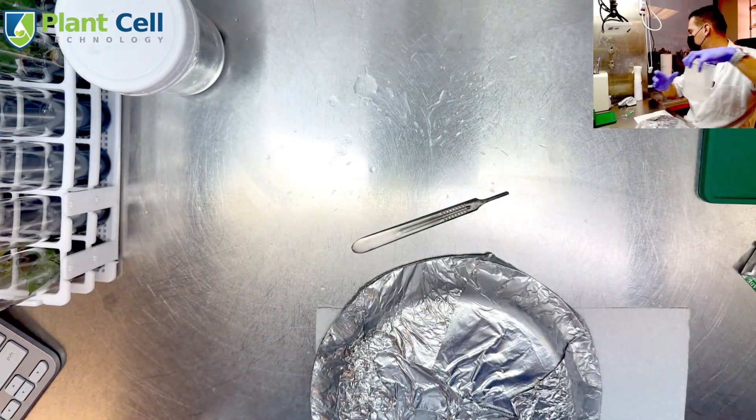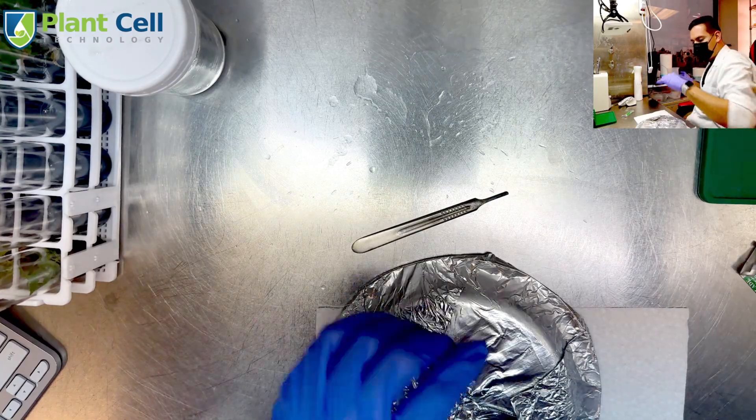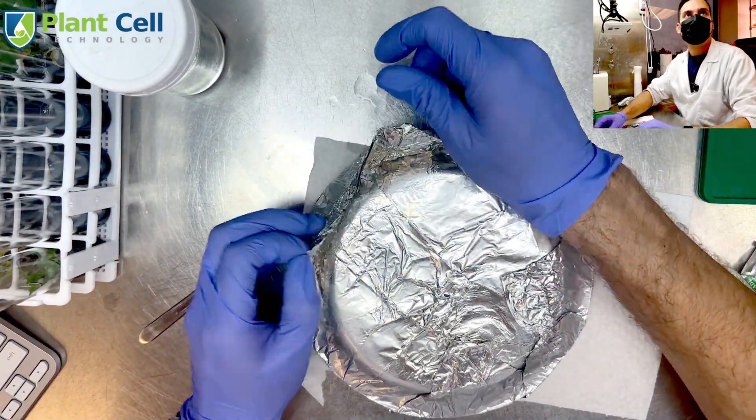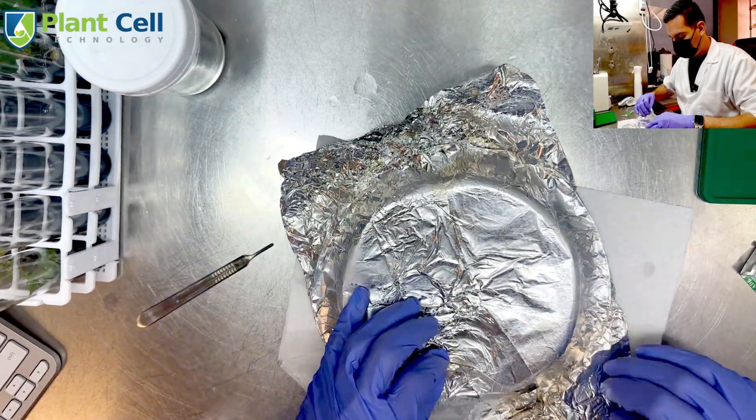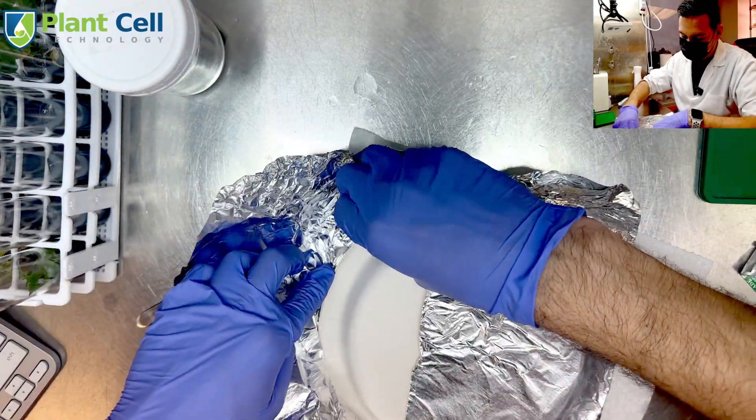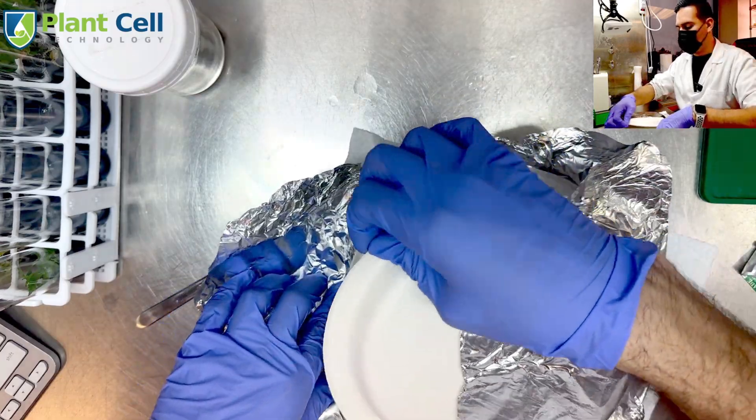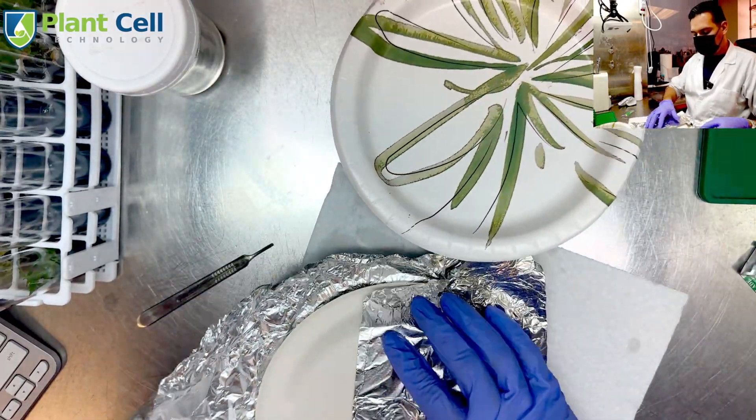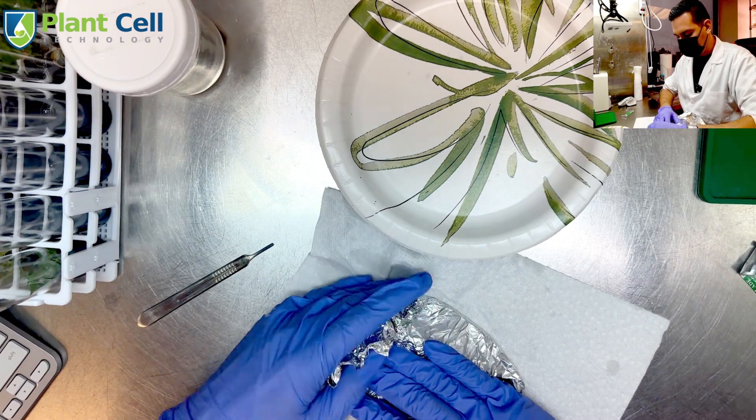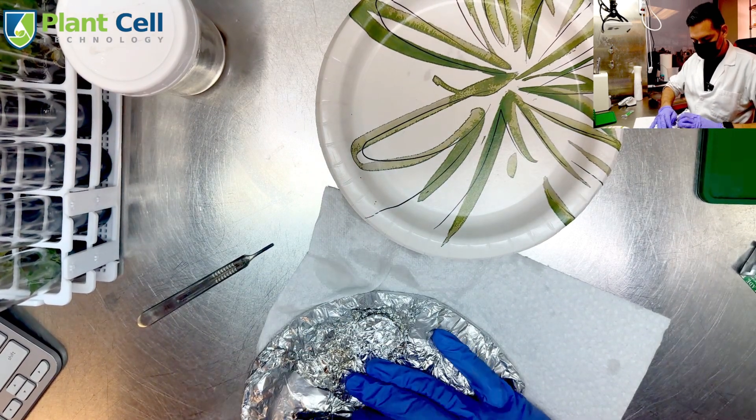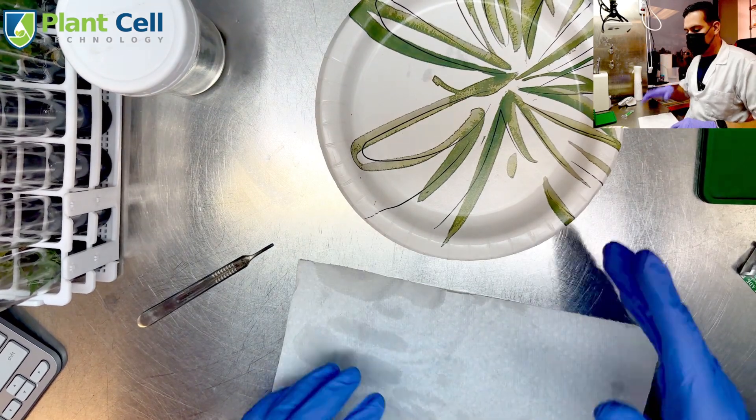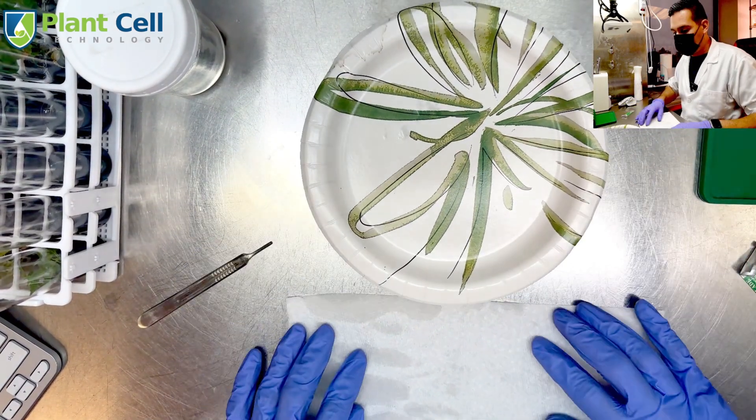Move that to the side. Alright, so now I want to take a sterile plate to cut my plants. I only need one. There we go, so I have a clean sterile surface to cut my plants.